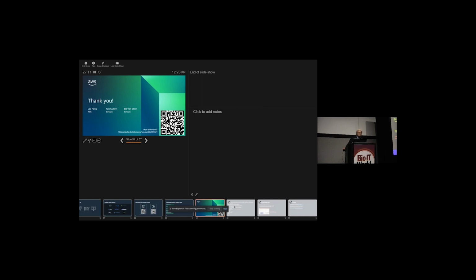Yeah, so we've seen up to 60% savings, based on how frequently you access it, when comparing to S3 Intelligent-Tiering. So that's a big deal. And it has that intelligent tiering built in, so you get the benefit not only of the compression, but also of the discount for when you don't touch it. Yep.